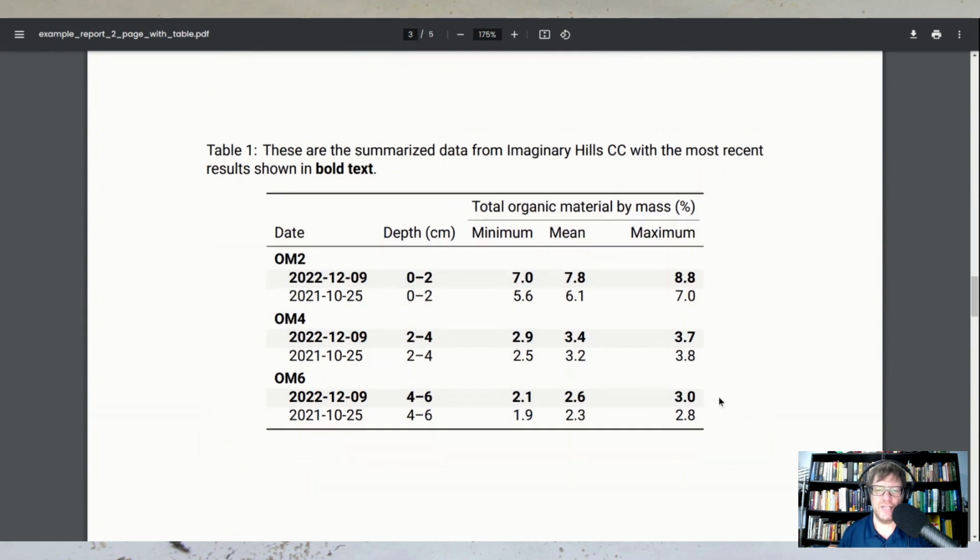And so this is just a data table where we show all of the clients' data at the different depths. So we've got the sampling date, we've got the depths, and we have the minimum value that was tested because people are testing multiple greens, and we have the average value, the mean value, and we have the maximum value. So I have some clients where this data goes back 7 years for this particular test. For the soil nutrients, ATC also does soil nutrient testing, and for that we have data that's going back almost 20 years for some of our long-term clients.